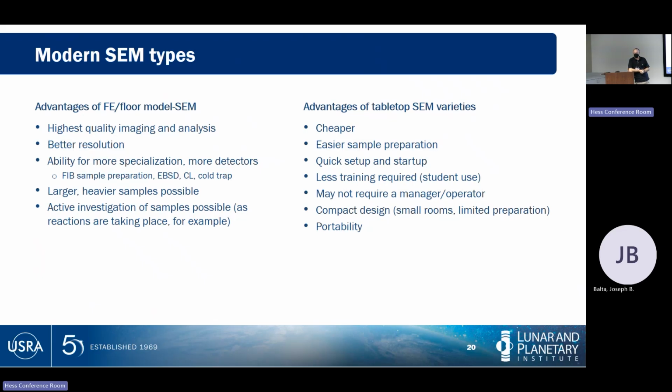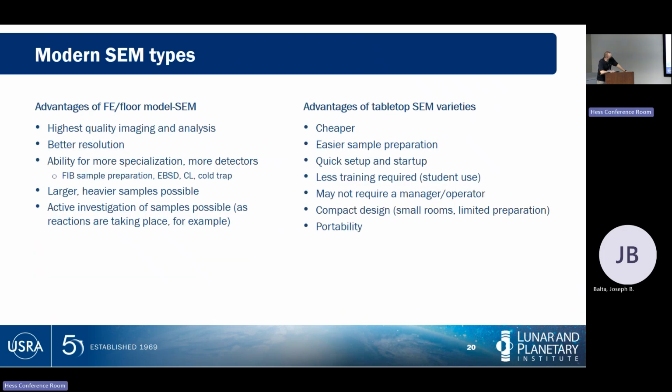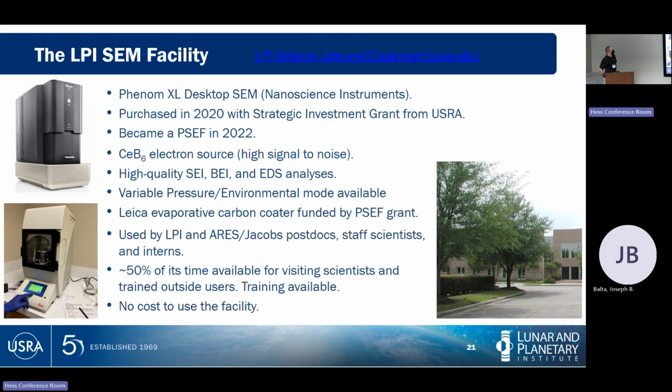So, you know, literally out in the field, you can pull a sample off a lava flow and put it into an electron microscope in minutes after it cools to get it in there for analysis. So each of them is useful in their own way. Each of them has their pluses and minuses.